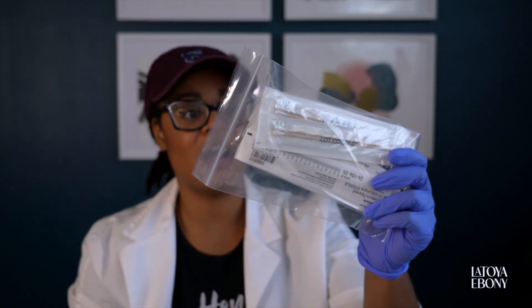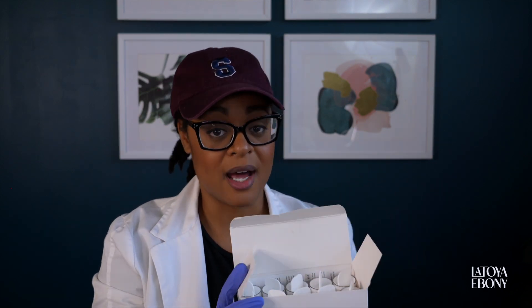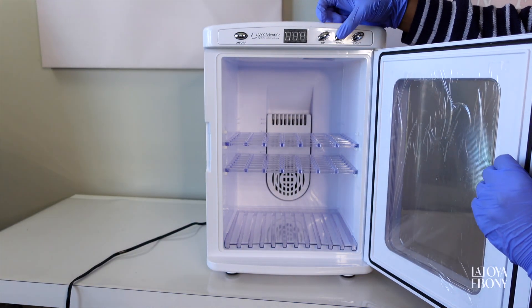It even comes with some swabs that you can use. These tests are used to test bacteria growth, yeast growth, mold — all the things in your products. Especially if you're going to be giving them away to family and friends or selling products, you want to test every batch to protect your loved ones and customers. It comes in a set of 10, and you use an incubator to keep an optimal constant temperature. Over time, you'll be able to see if there's bacteria growth, which tells you if the batch is safe for people to use.